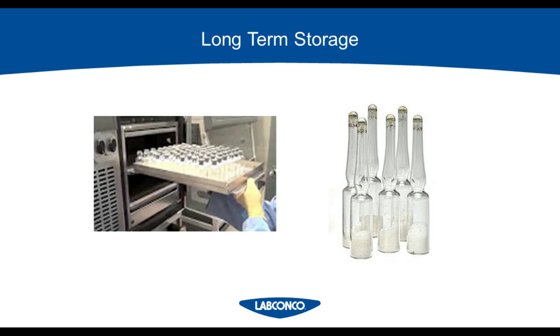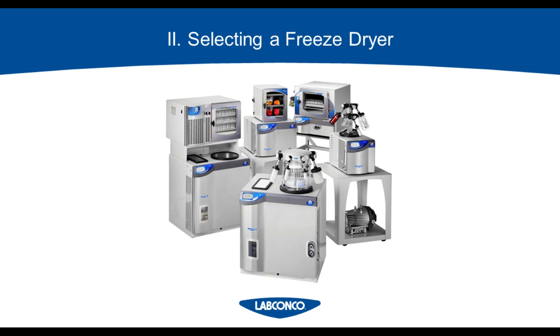For long-term storage of your samples, you will want to complete secondary drying, and you'll also want to stopper or seal your samples under a vacuum. By stoppering your samples under vacuum, you avoid exposing your samples to the moisture in the air when you open the door. Another way to achieve long-term storage is to flame seal your samples and ampules before the vacuum is released.